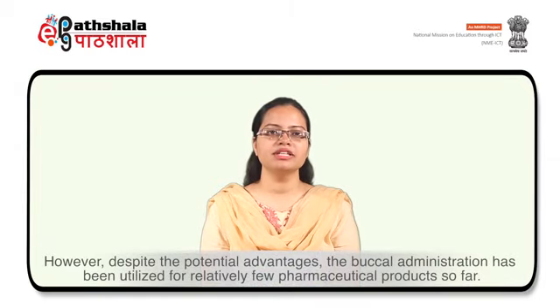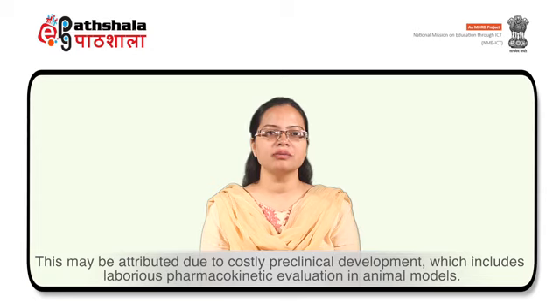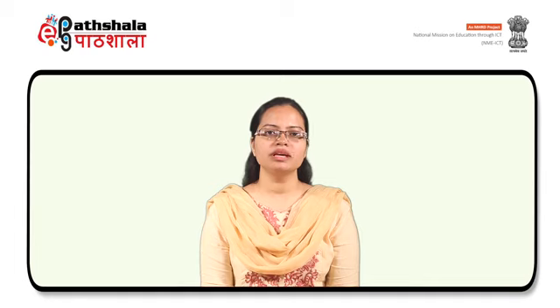However, despite the potential advantages, buccal administration has been utilized for relatively few pharmaceutical products so far. This may be attributed to costly preclinical development, which includes laborious pharmacokinetic evaluation in animal models. Thus, suitable in vitro methodology can greatly aid in early development by subjecting a greater number of compounds or formulations to the evaluation of their potential for buccal absorption.